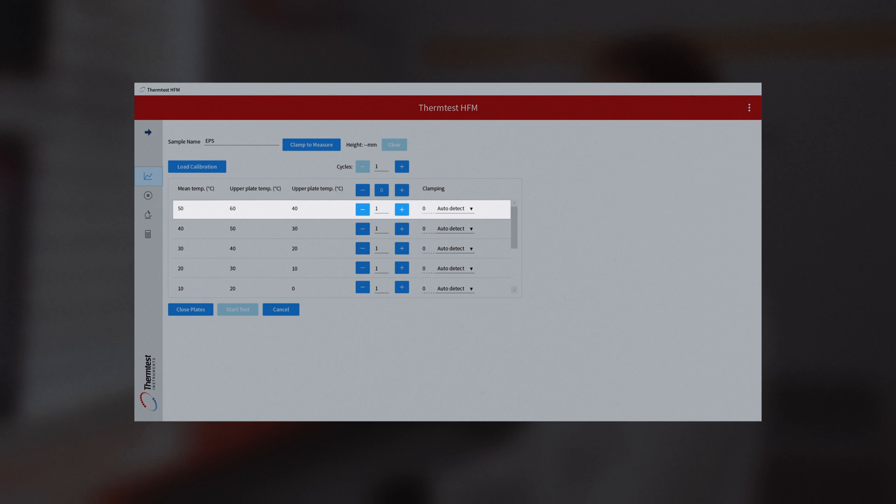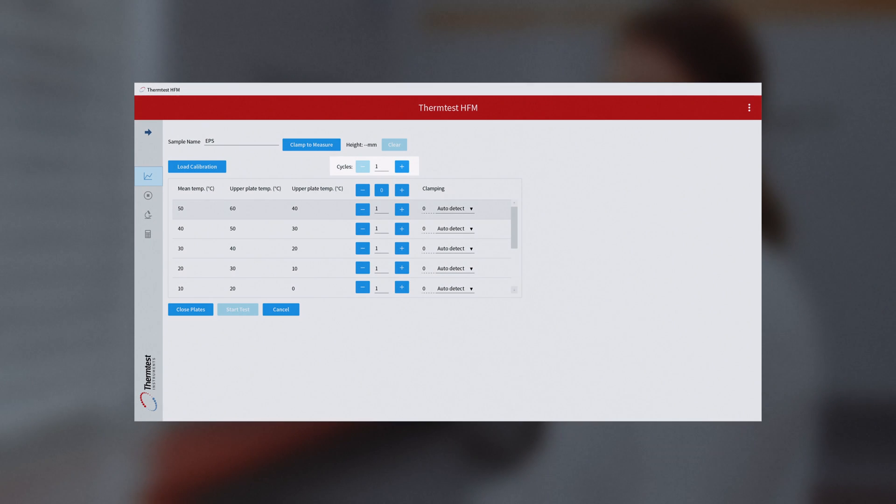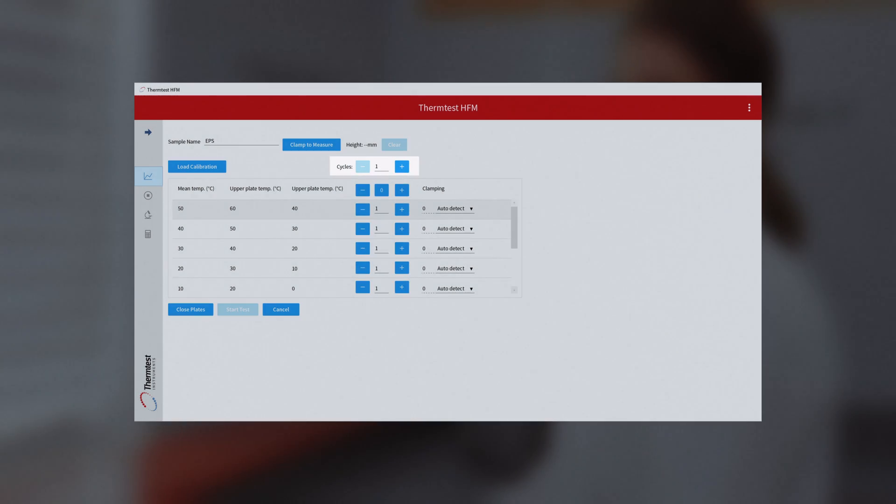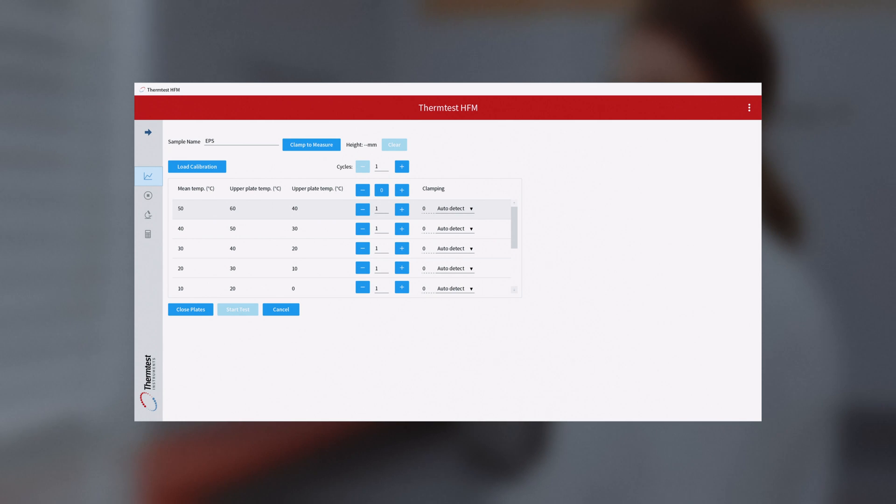After calibration, several testing schedule options can be used to repeat testing at the same temperature. The cycle feature allows the user to run the same schedule more than once. These powerful tools can be used to study the application life of materials.